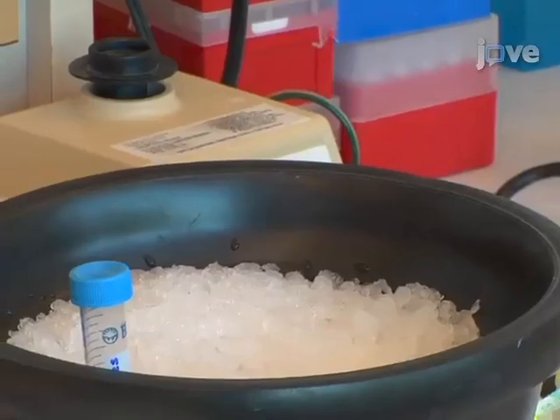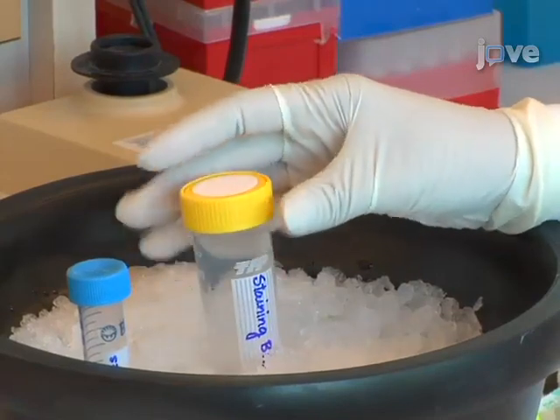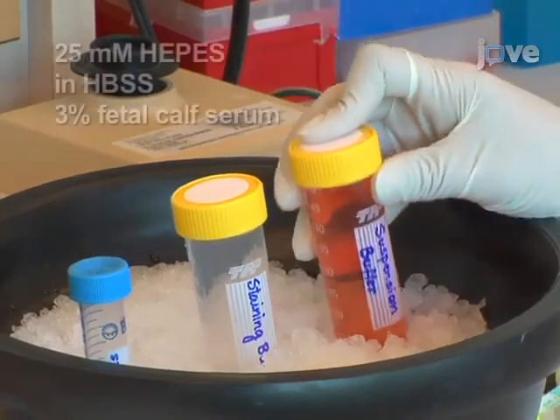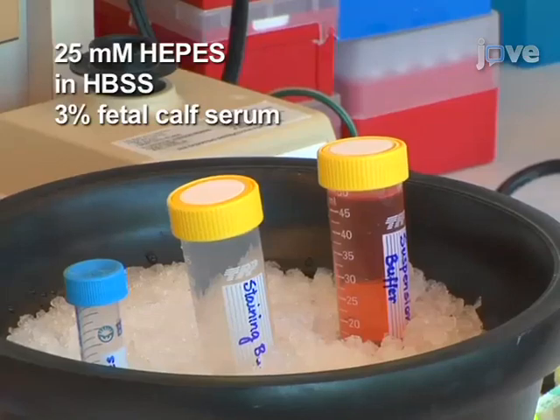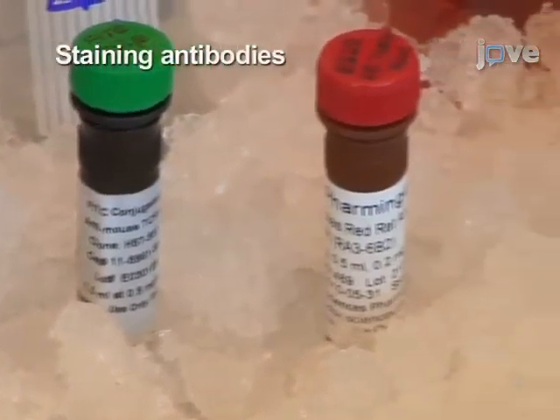Before beginning FACS, the solutions and reagents needed for the protocol should be placed on ice. These include staining buffer, consisting of phosphate-buffered saline with 3 percent fetal calf serum; suspension buffer, consisting of 25 millimolar HEPES prepared in Hanks Balanced Salt Solution, or HBSS, containing 3 percent fetal calf serum; and a 25 millimolar HEPES solution prepared in fetal calf serum.